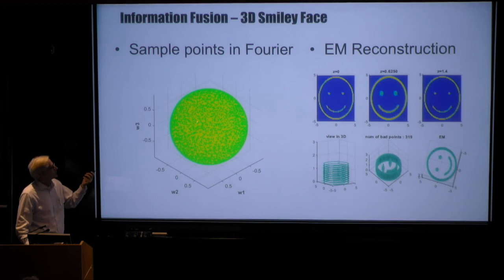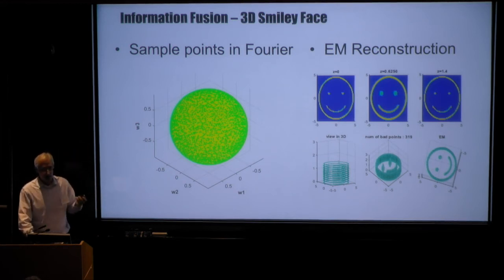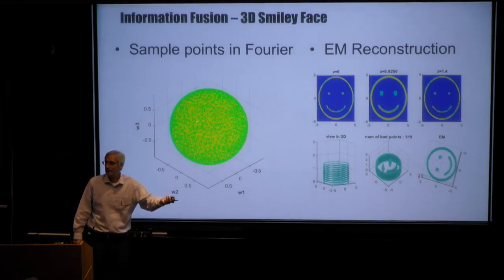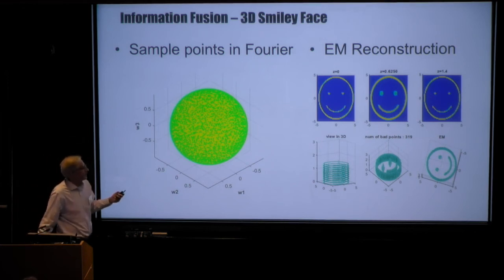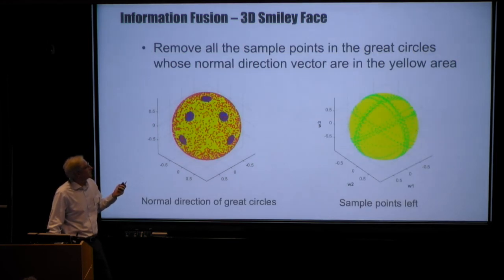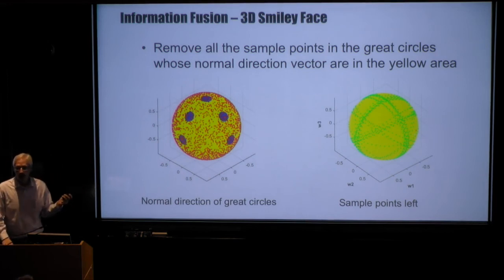Now, suppose that the green here corresponds to all the, let's say we have many, many projection directions. Okay, you have a rich set of projection directions, then there should be no surprise that we can reconstruct the smiley face. That's what you folks do day and night in reconstructing high quality densities from EM. But what if we have a very restricted set of projection directions?